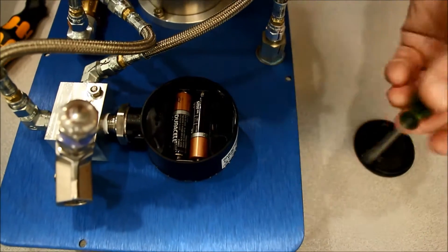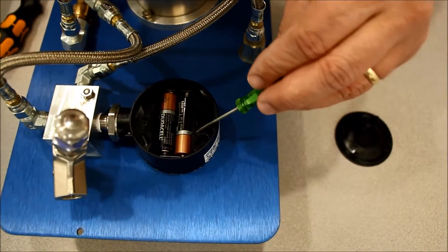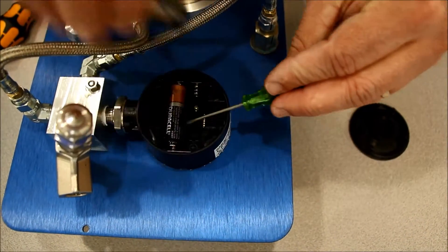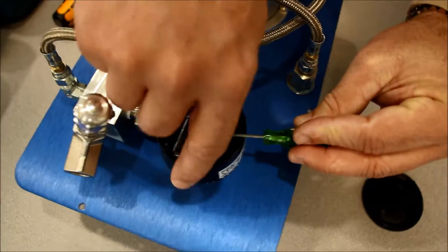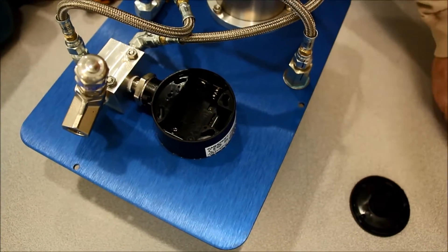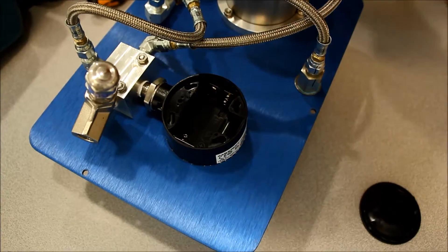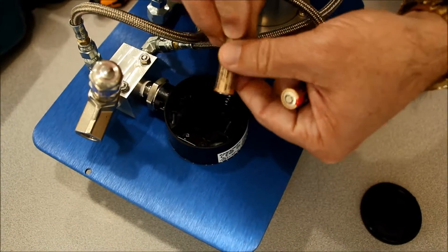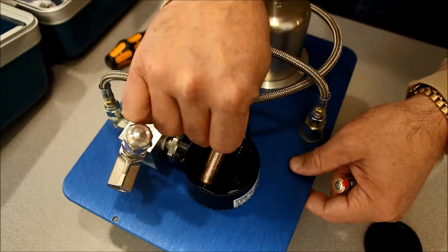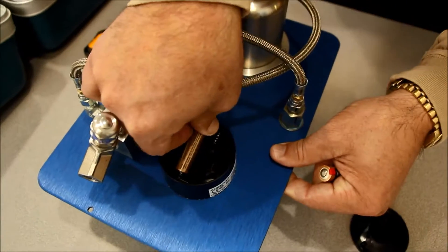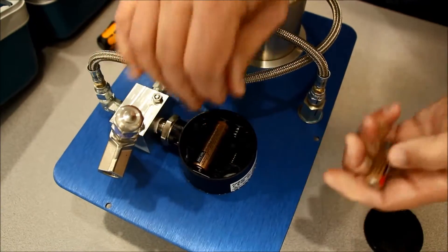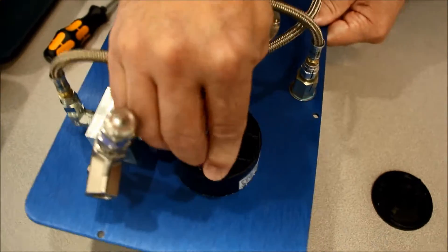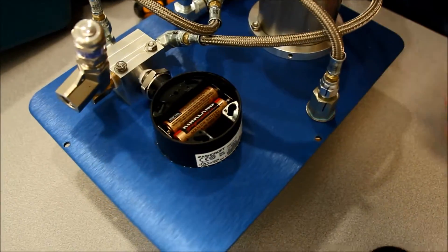We're going to use a little screwdriver or something just to pop those loose. Take out those batteries. Then we're going to replace them with the negative end down at the spring. Pop the new ones in.